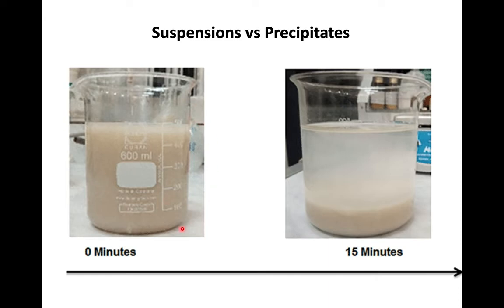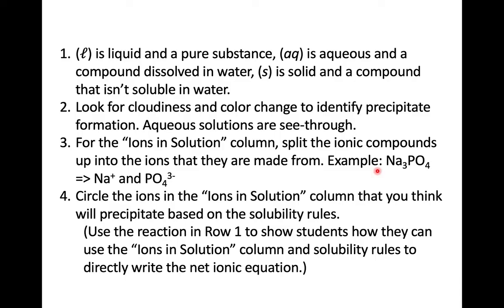We have this suspension here on the left, and it was timed, and after about 15 minutes you see that the majority of this material settles to the bottom and ends up as a precipitate, and the supernatant solution clears. Given enough time, this would go completely clear.